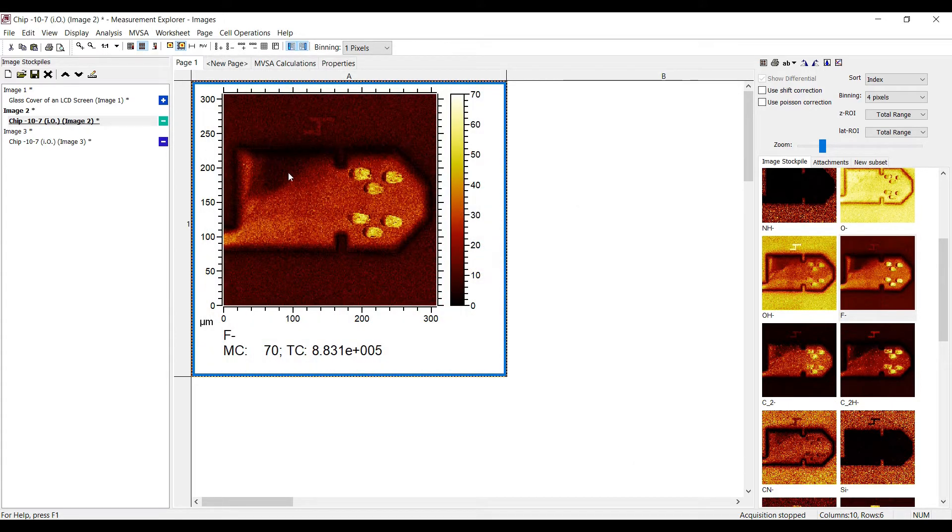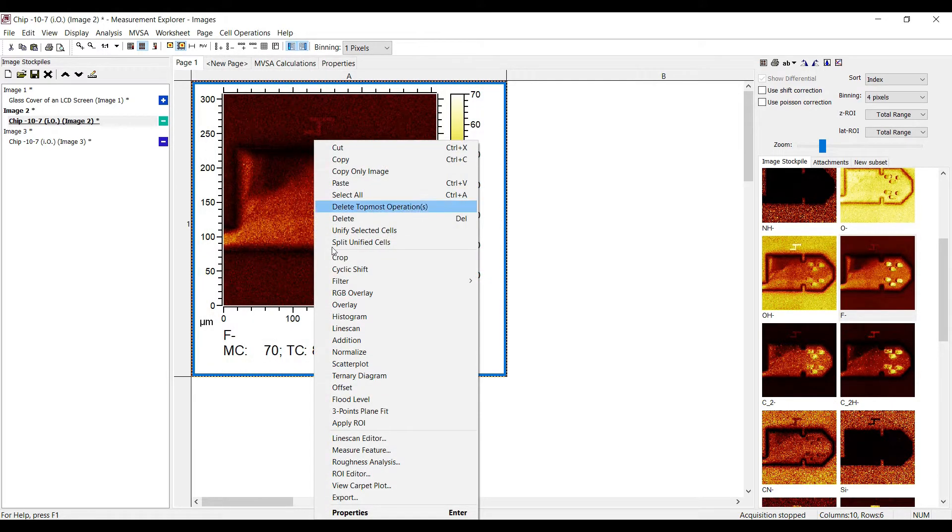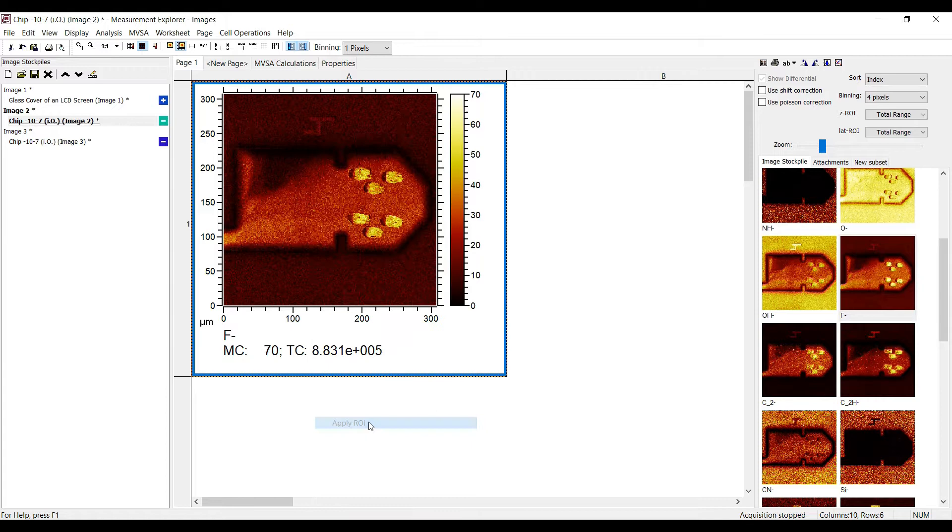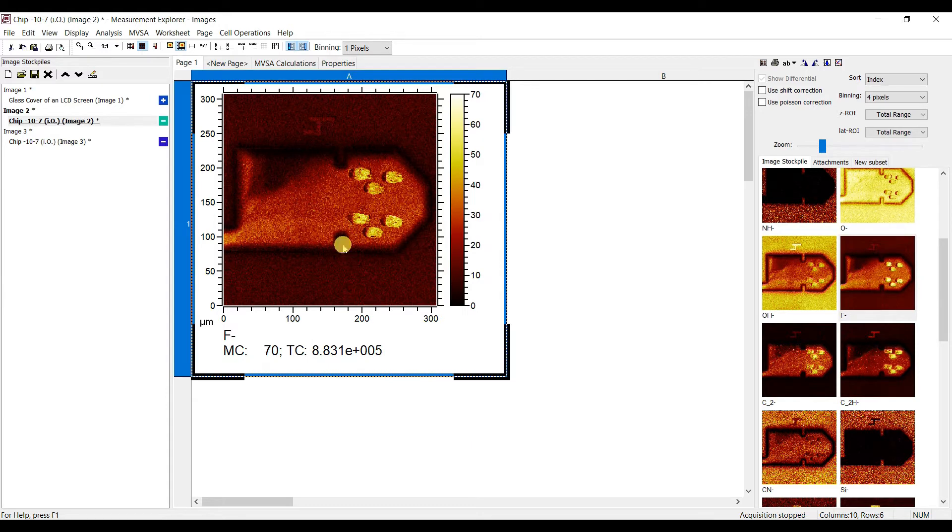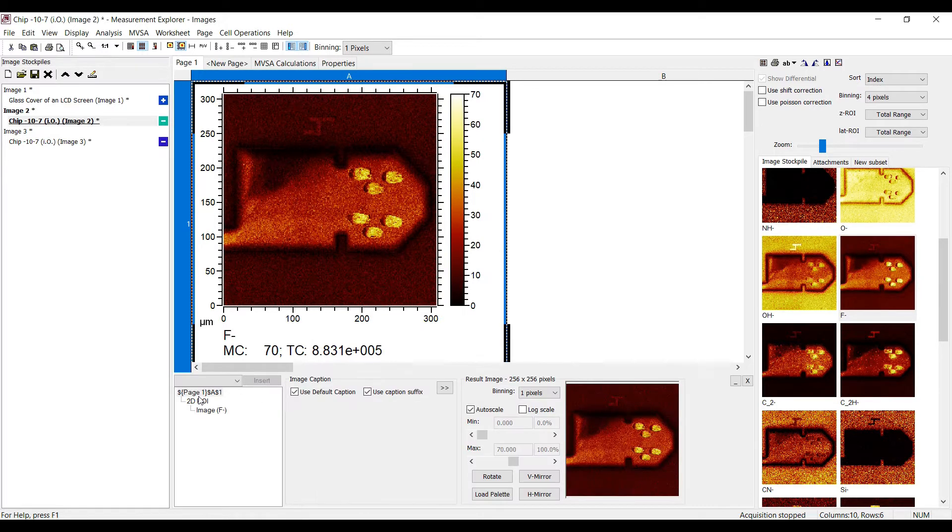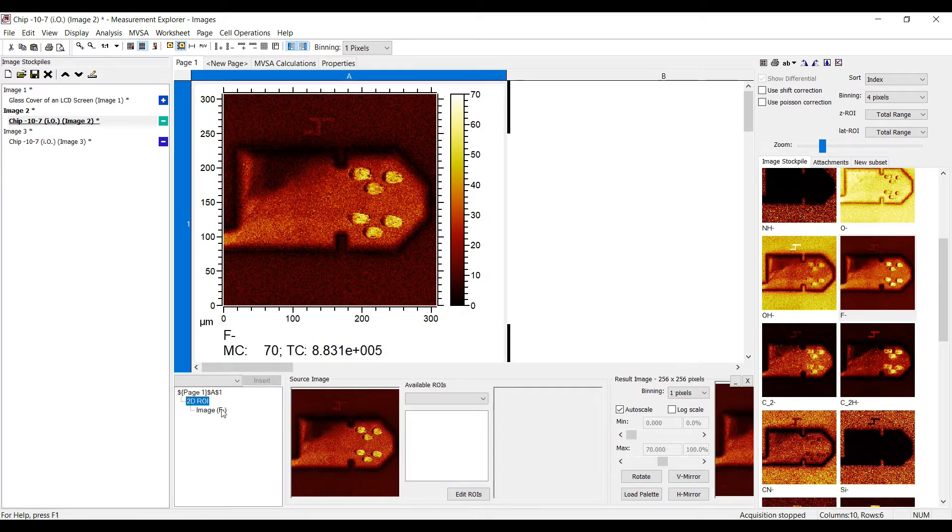On the worksheet you can apply the 2D ROI to the image with the respective cell operation from the context menu.